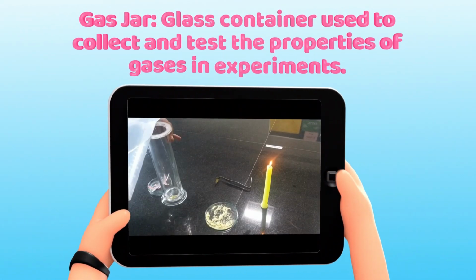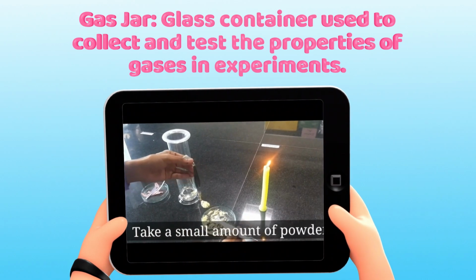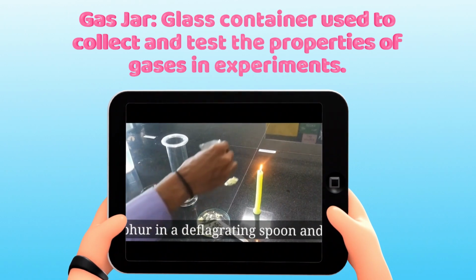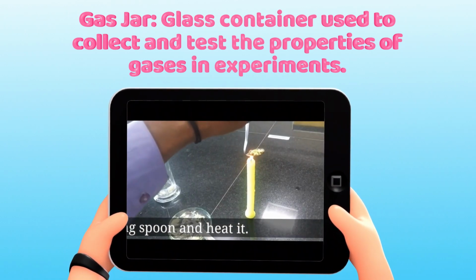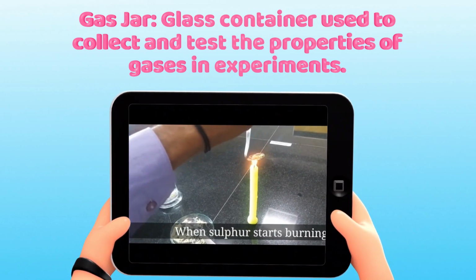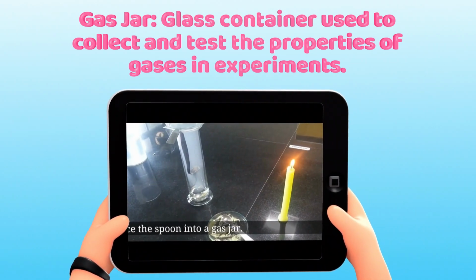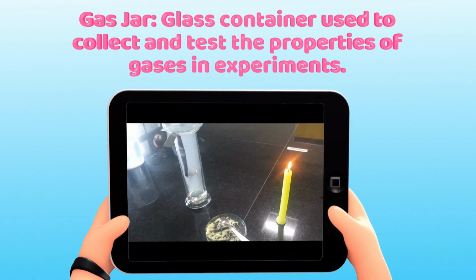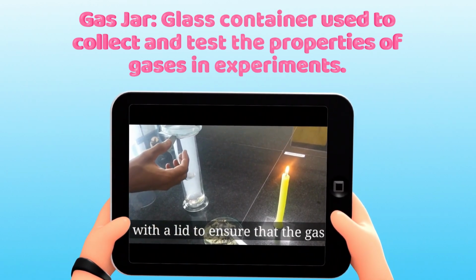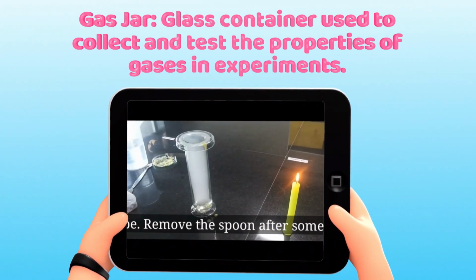Another apparatus is a gas jar. A gas jar is a glass container which is basically used to collect gas and test the properties of gases in experiments, such as when you are testing the properties of sulfur gas. As you can see from the screen, the glass on the left, the white one, is what we call a gas jar, used for gas properties testing.